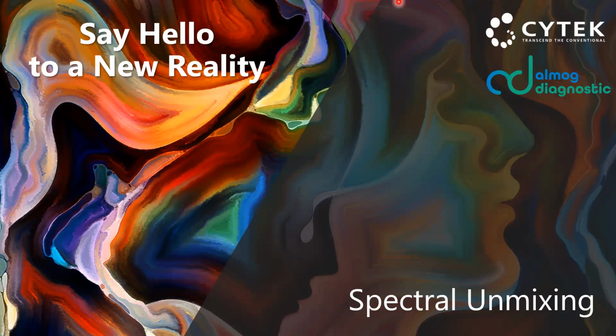Yes. So, hello everyone. My name is Aviva, and I will talk about some technical and scientific aspects of spectral flow. Now that we have talked about fluorochromes and how we can obtain unique signatures, let's talk about spectral unmixing and how it works for our system.